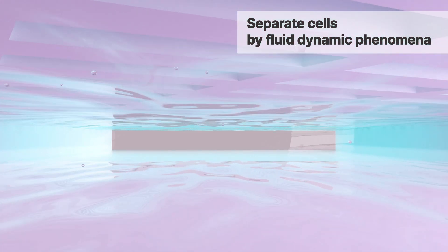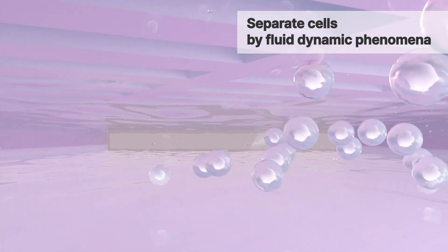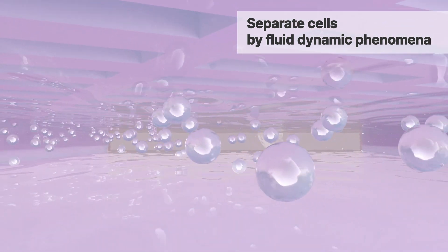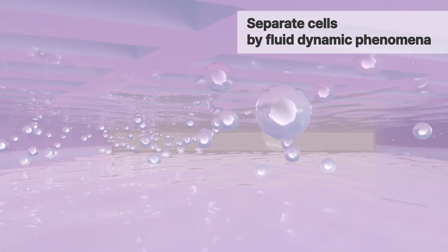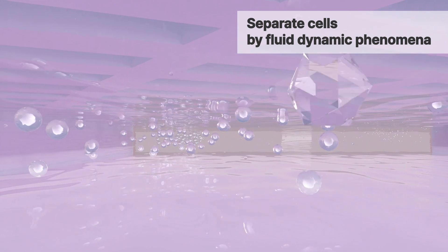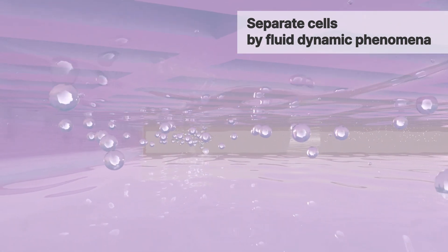The cell suspension undergoes separation into cells and culture medium within Cell Puree as it passes through the microchannels, driven by fluid dynamics. These microchannels are strategically designed to concentrate cells based on their size. Cells are directed to one side while waste media flow to the other side.